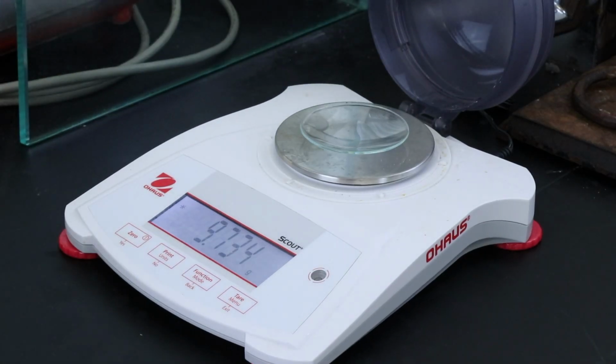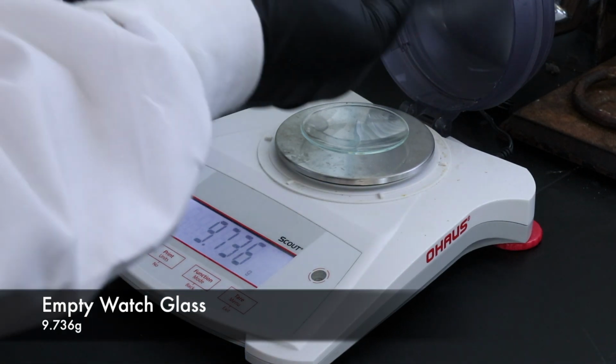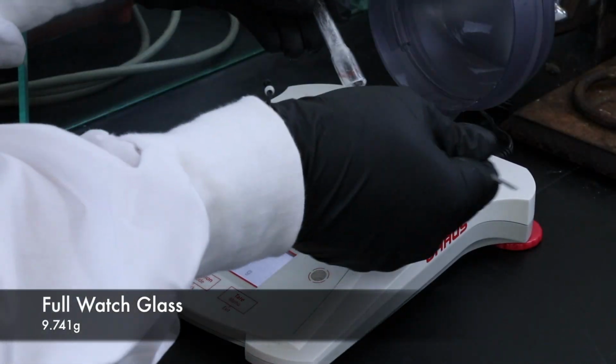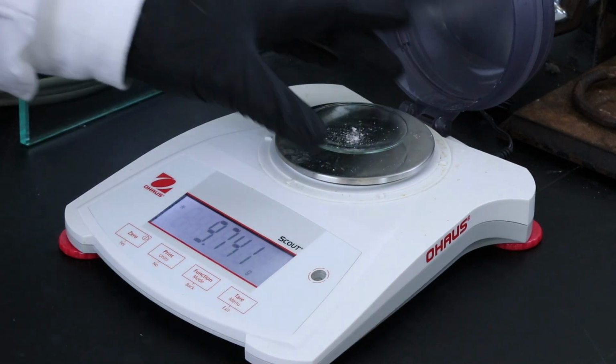Now I'll weigh out the crystals so we can calculate a percent yield. The empty watch glass is about 9.736 grams, and the product only made it jump up to 9.741 grams. So I didn't isolate very much, but let's characterize it to see how pure it is.